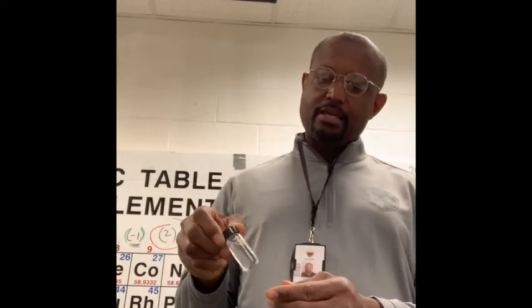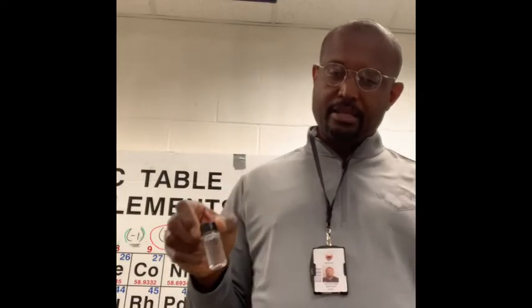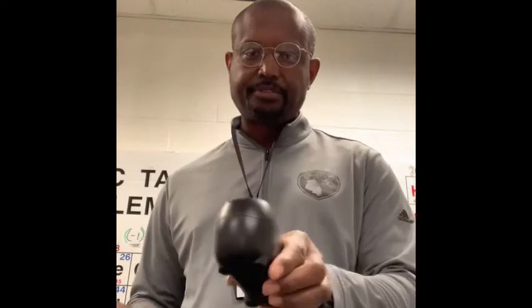And so I brought a sample of water back to the lab and placed it in a vial and calibrated my turbidity sensor, and now I'm ready to measure the turbidity of my lake water.